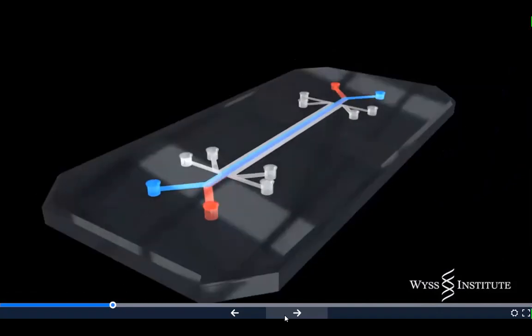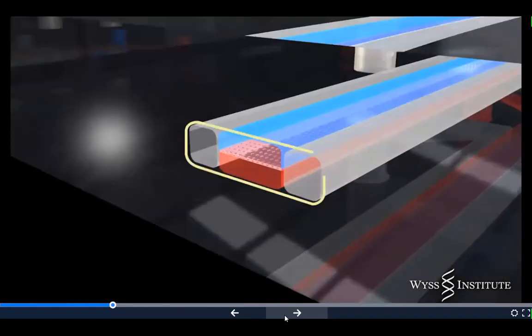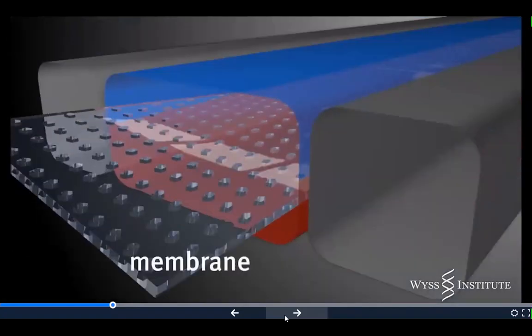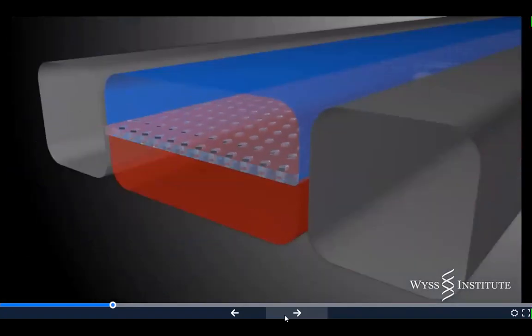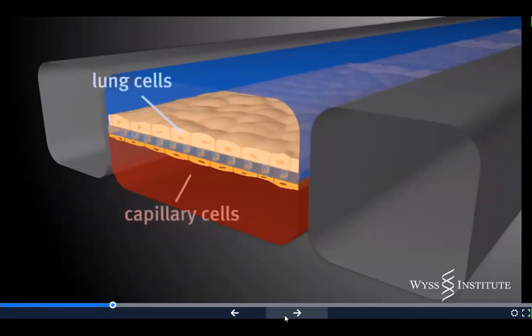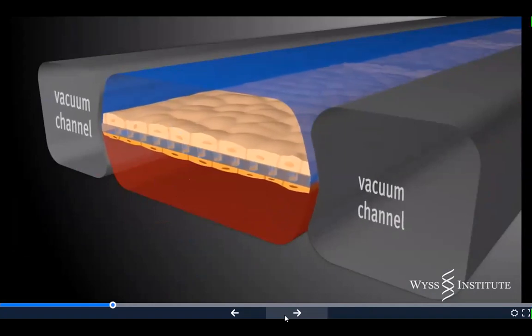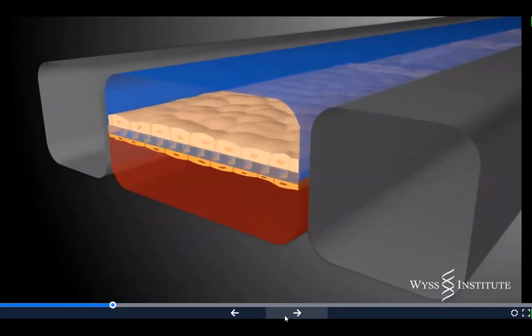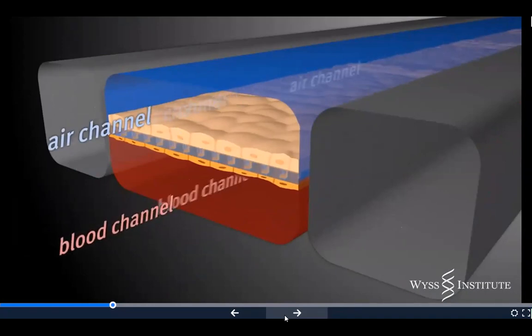This device has been used for a long time before this paper, and it's kind of a hallmark or symbol of microfluidics, especially organ on a chip. I'm sure that you have seen this video or pictures of this device in many microfluidic and organ-on-a-chip presentations.